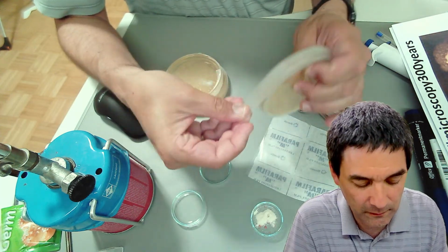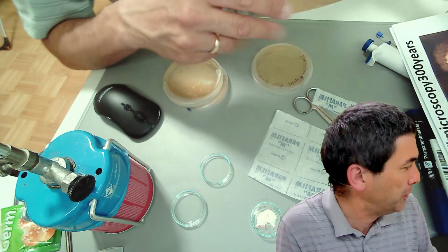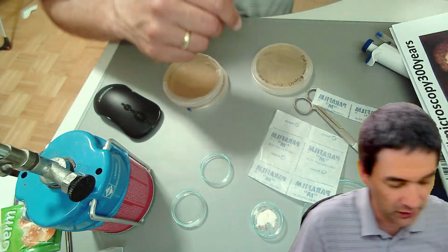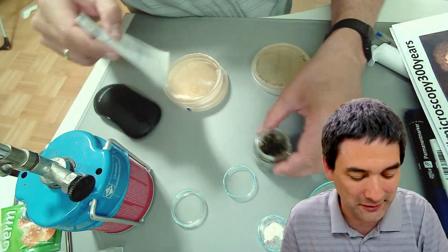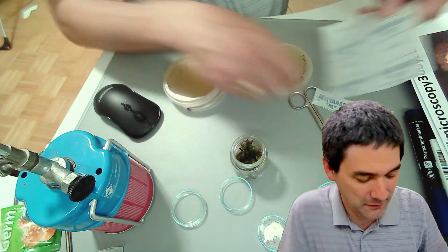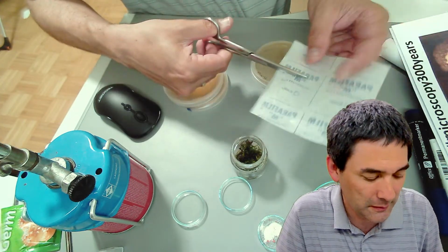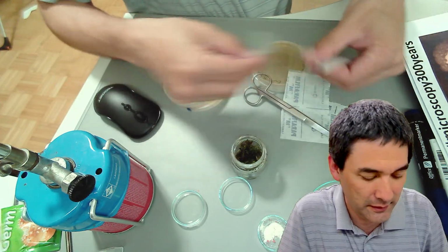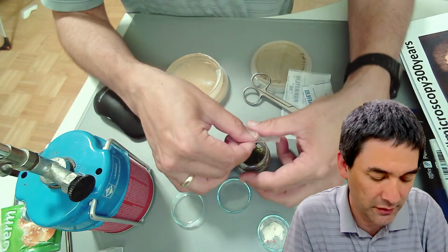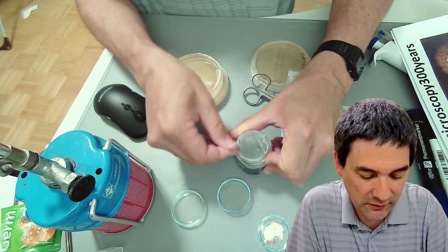This parafilm is actually also used to cover other things, like, for example, bottles, or, look, why not? I've got some moss here. And what you can do is, if you want to, you also take a little bit of parafilm, and look, you can also cover it like this.